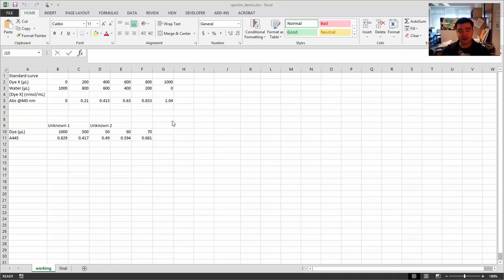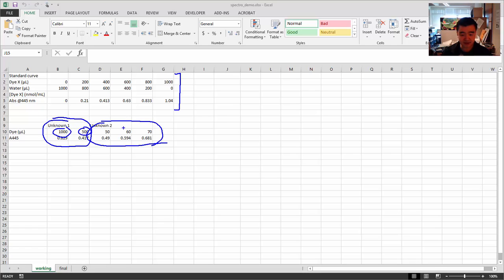So in this video I want to show you how to analyze your Excel data. In this spreadsheet in front of you, we have the standard curve measurements up here, and then we have the measurements for the first unknown dye over here. This is 1000 microliters and 500 microliters of that first unknown, and we also have the measurements for the second unknown here in terms of microliters of the dye, and also the absorbances down here as well.